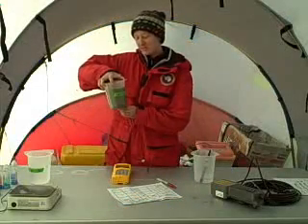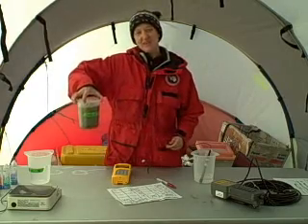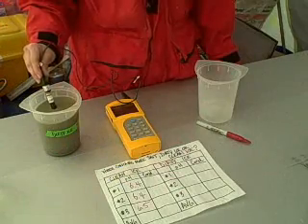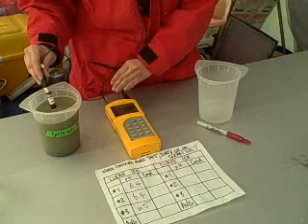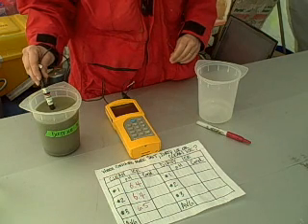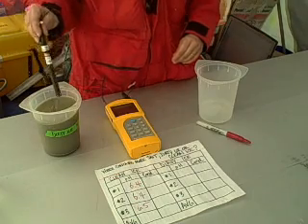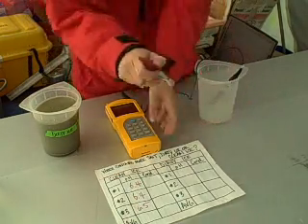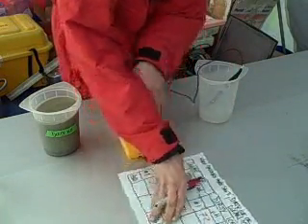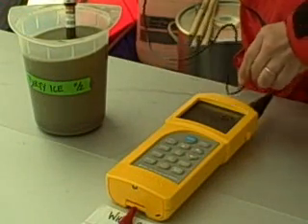For our next group of measurements, we're now going to look at the pH of our dirty ice using the same pH meter. Alright, let's start the pH of the dirty ice. So we stick the probe into the dirty ice, wait for it to settle down. So it leveled out at about 7.2. So our first was 7. Alright, now our second pH for the dirty ice.